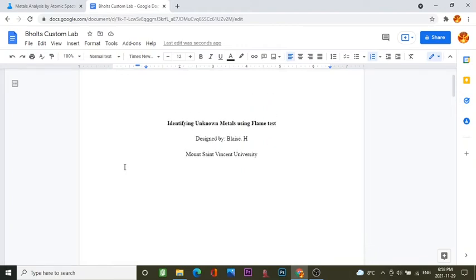Hello, I'm Holt, and welcome to my custom lab. This lab is identifying unknown metals using the flame test.